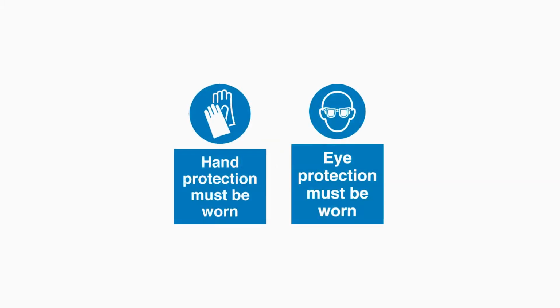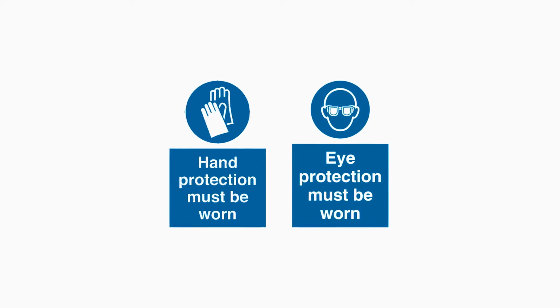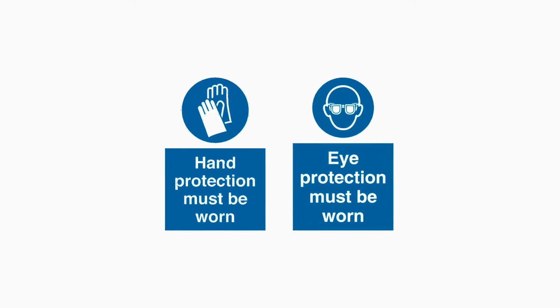Ensure all safety instructions are adhered to. Health and safety information can be found on the bottle labels provided with the test kit. MSDS are available upon request.